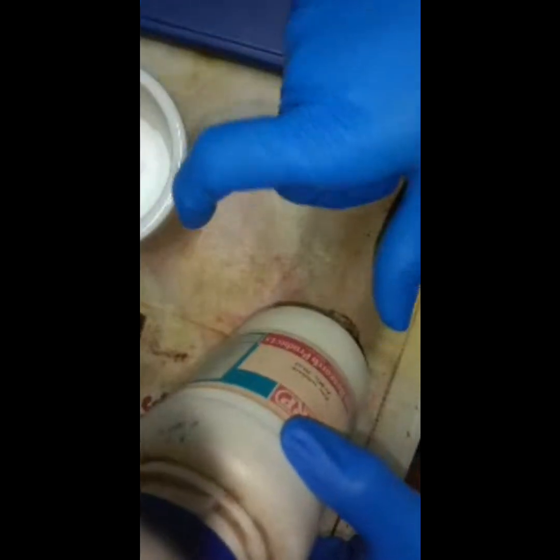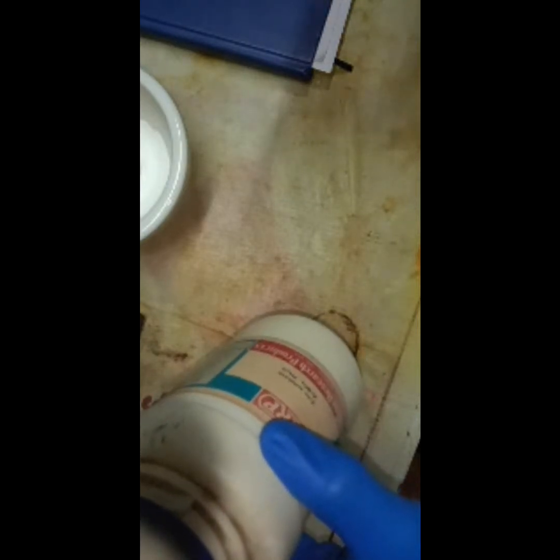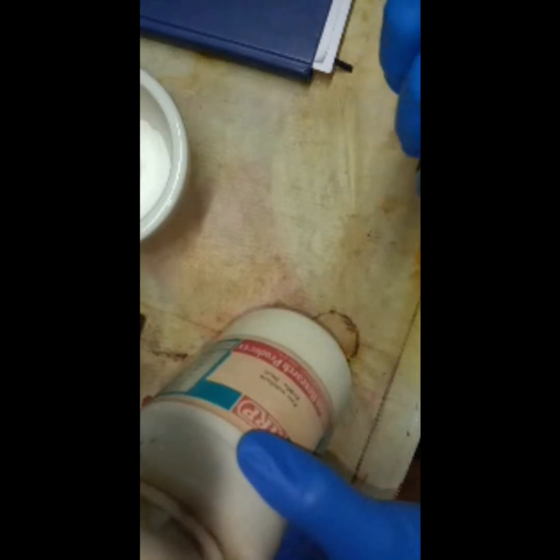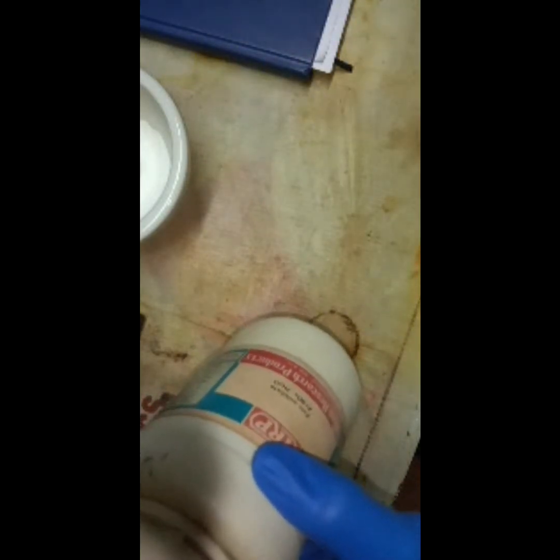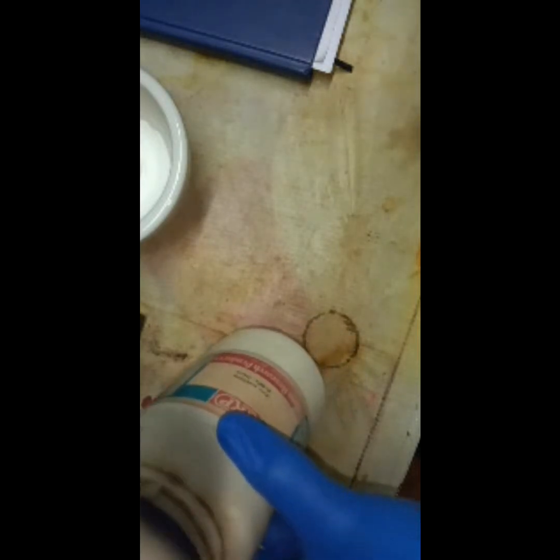These chemicals are from Indian Research Products; we are buying the chemicals from Indian Research Products in Chennai. These samples are zinc sulfate, ZnSO4·7H2O, with the molecular formula and molecular weight used to calculate the samples.